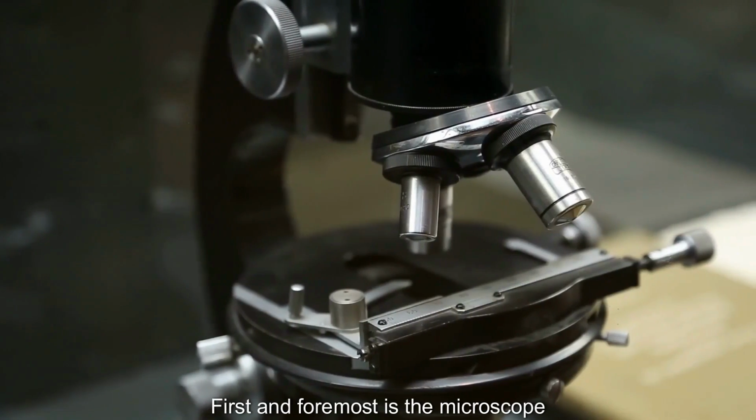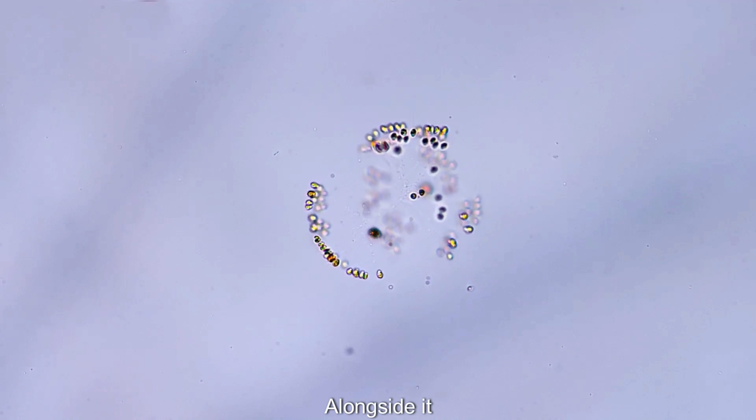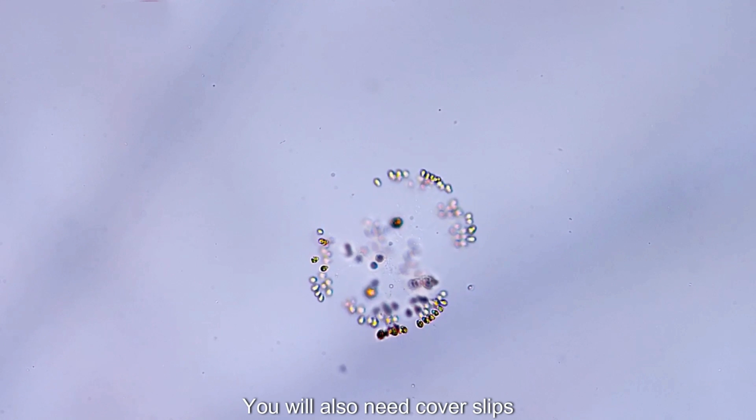First and foremost is the microscope itself, our window to the small. Alongside it, you will need clean glass slides. You will also need cover slips. Next, we need tools for handling our samples. A simple pipette or eyedropper is invaluable. A pair of fine-tipped tweezers will be your best friend.